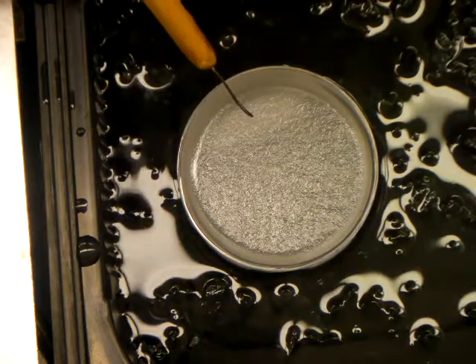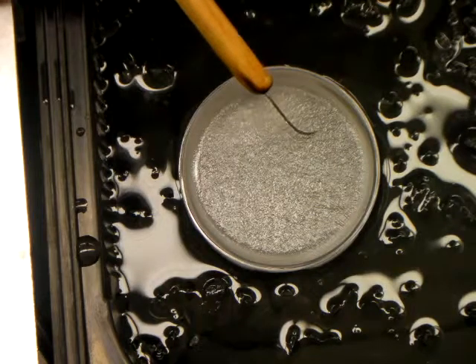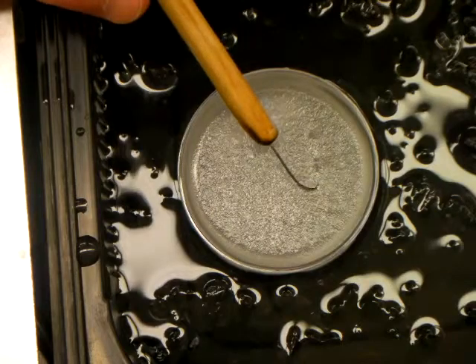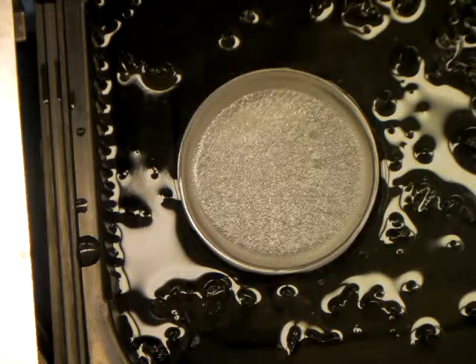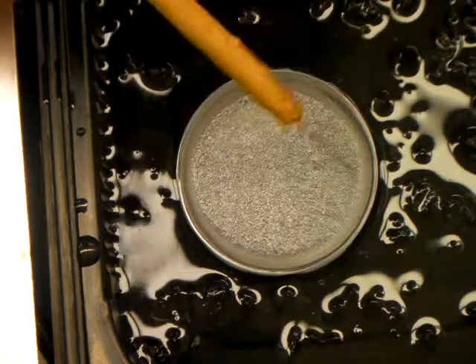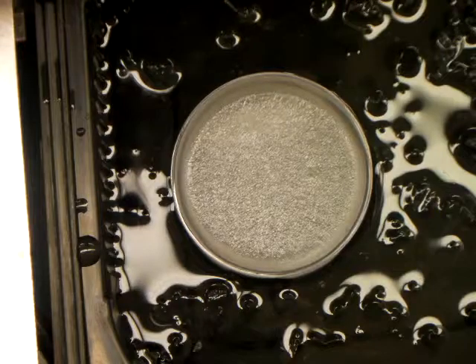To determine if it's there yet, you can go ahead and nudge it with the probe — it's still quite liquid. I want to allow it to get a little more solid than that. You can see it's starting to solidify around the edges very well; just need this skin on top to get a little more solid.